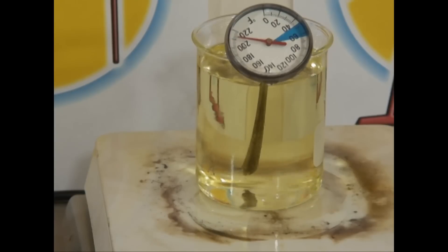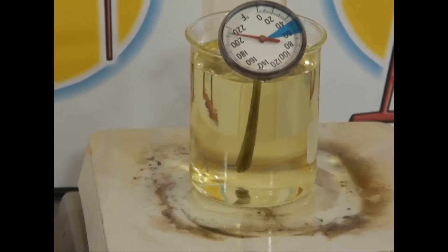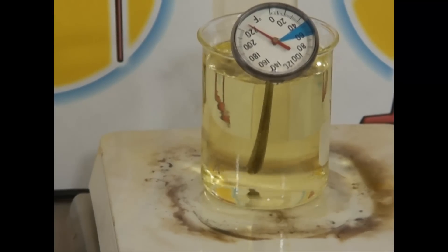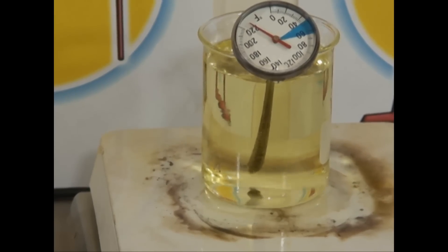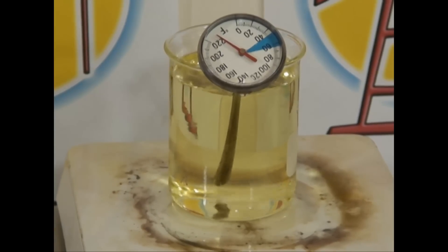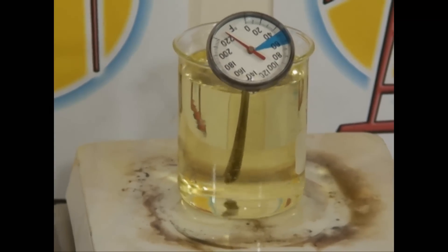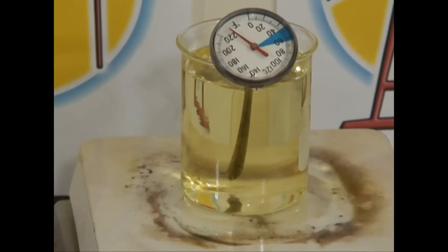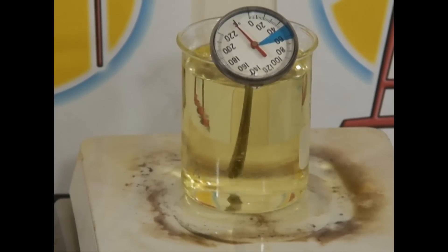We're just reaching 120°F and you can't really notice it, but there are just a couple of bubbles starting to form. As temperature increases you'll see more bubbles. Eventually the temperature will increase and the bubbles will stop or slow down — that's when we turn the heat off.